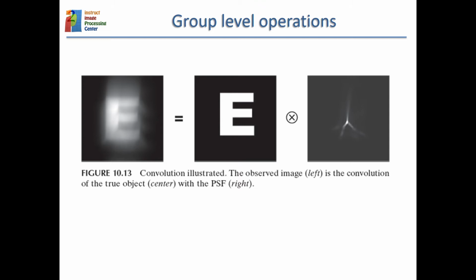The kernel doesn't look like this one with a kind of triangle, but the triangle illustrates very well the effect of the convolution. The effect of convolving something with a kernel like this one is moving the image along this direction, and then what you are adding are multiple copies of the input image along this direction. That is why it blurs in that direction.